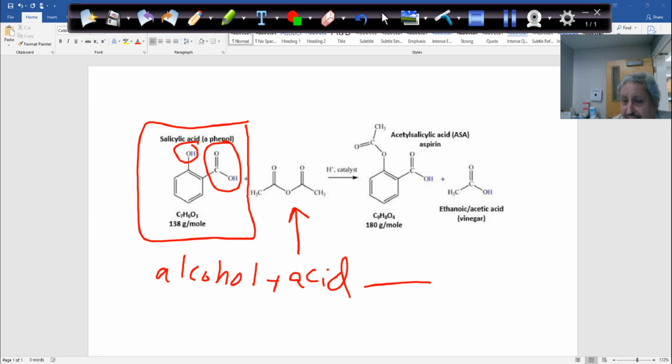So when you have acid and alcohol, you make what? Somebody will tell me what you make? Come on, guys, don't let me down. Don't let me down here, please. Okay, guys, don't let me down, as I say.